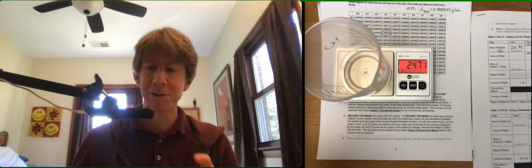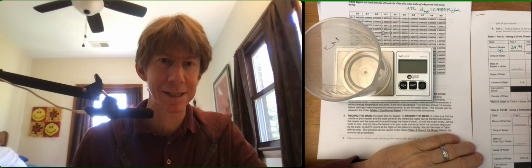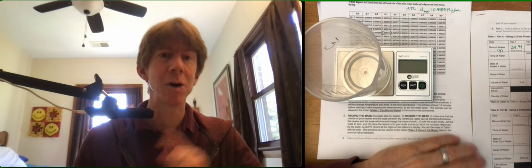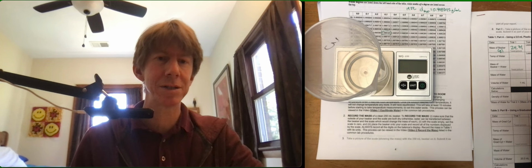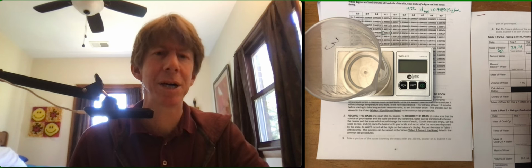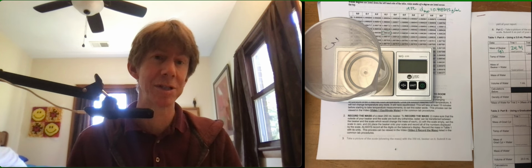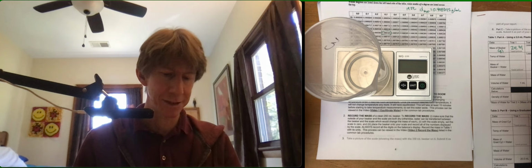And we need to take a picture. My camera's actually recording right now, so I'm not going to take a picture. Notice that your scale goes off over time, especially if it's not plugged in. Oh, here's the other thing I was going to say. If it's fluctuating more than 0.02 or 0.03, it's probably a good idea to plug it in and let the battery recharge, because we have found that sometimes that's what happens if it's low battery. And it doesn't always say that on the scale.